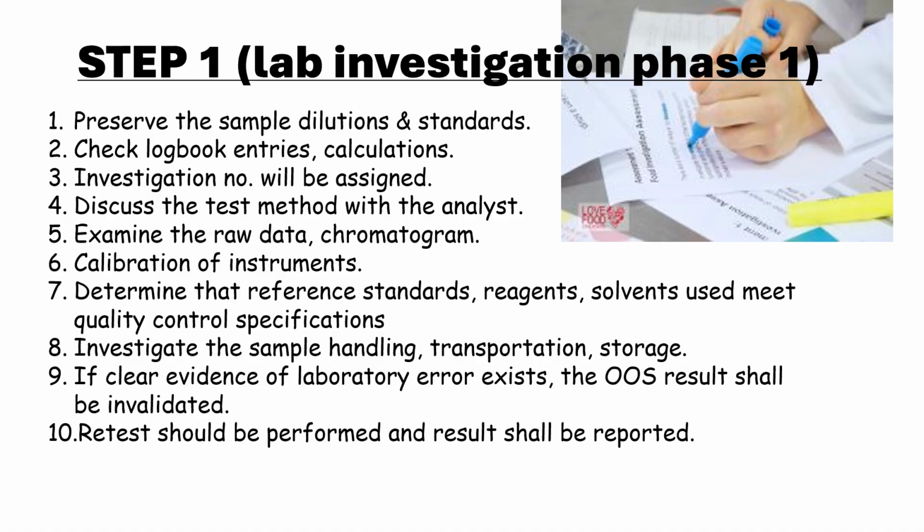Now, when an OOS is observed, the first thing that an analyst should do is preserve the sample, dilution, and standards that were injected during the sample analysis and whatever gave the result on the chromatograph.